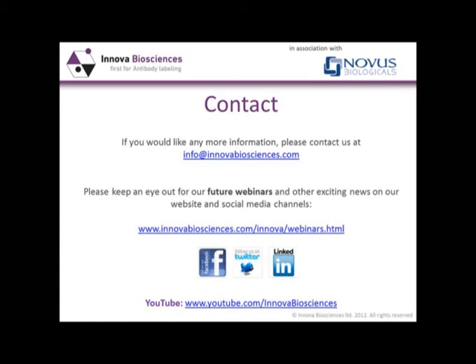Okay, that's an interesting question actually, Nina. There's nothing within the lightning link kit that would cause you a problem in itself for in vivo use. It's not something that we actually have tested for. Basically, the lightning link kit makes your conjugate in exactly the same way. You have an antibody. You're not adding any preservatives. There's nothing toxic in there, but that's not something that we've actually tested it for. I see no reason why it would cause you any problems.